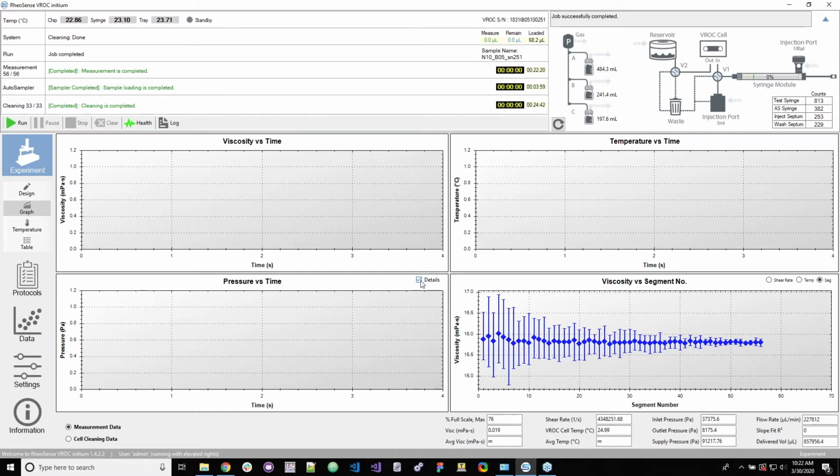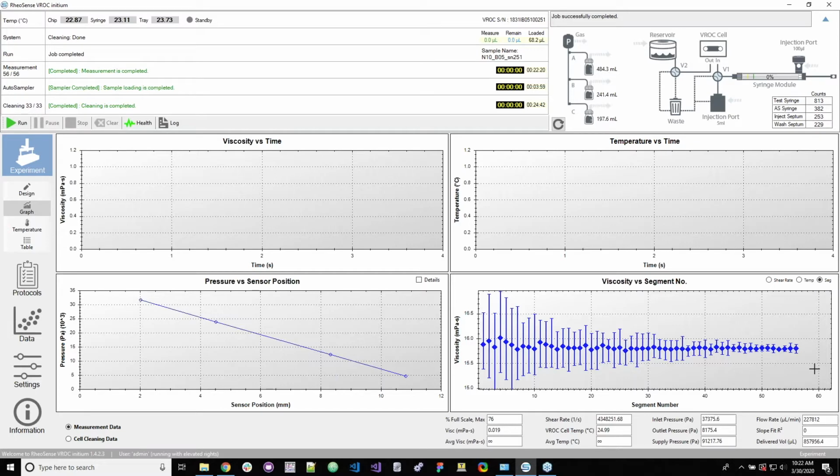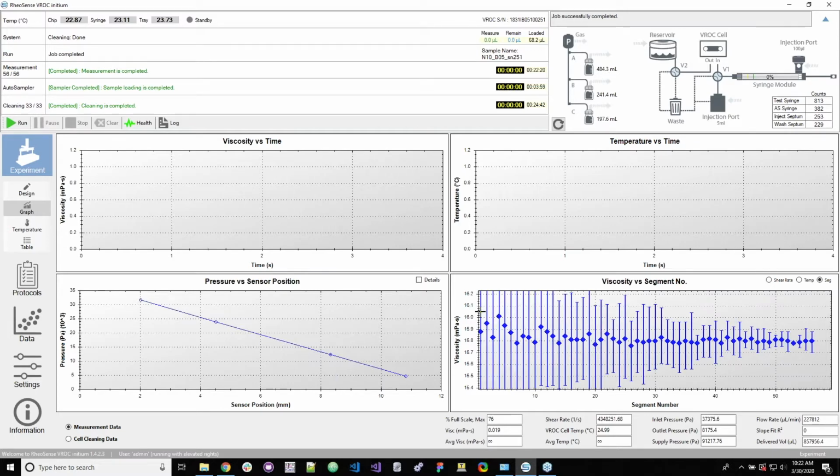So it should be a line like this with an R squared of at least 0.996. And then over here we have our viscosity values as a function of segment number. So segment number is just measurement number. So we can click and drag and zoom in and observe the viscosity of the chips, or the viscosity measured by the chip for each segment number tested.